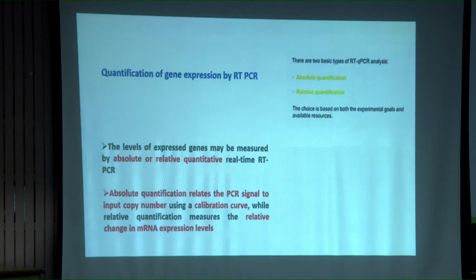If somebody is working on seed related pathogens, you want to estimate how much seed-borne fungi is there in the seed. The requirement here is that you need a specific primer which is going to amplify the target organism. That is in your hands only. You have to choose that primer and standardize it. Once it is standardized, you can easily develop a qPCR method for absolute quantitation of the target organism in any ecological niche. So I brought two distinct applications here.